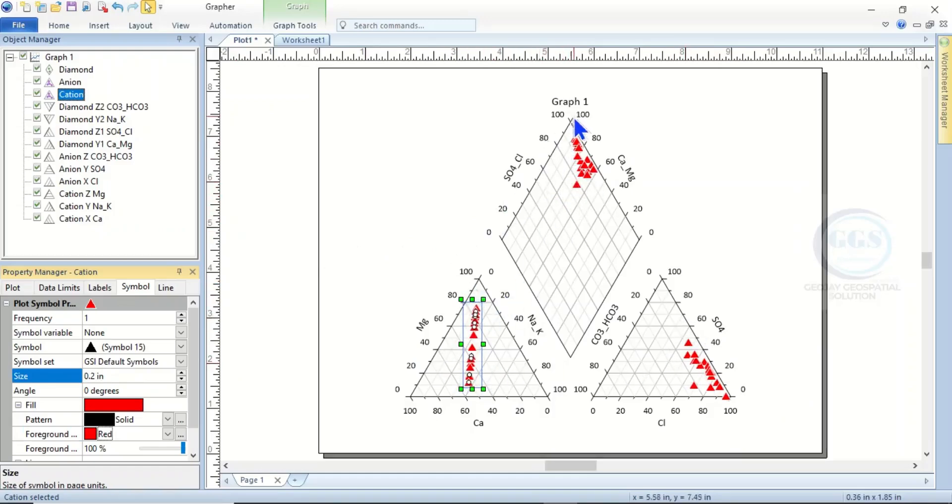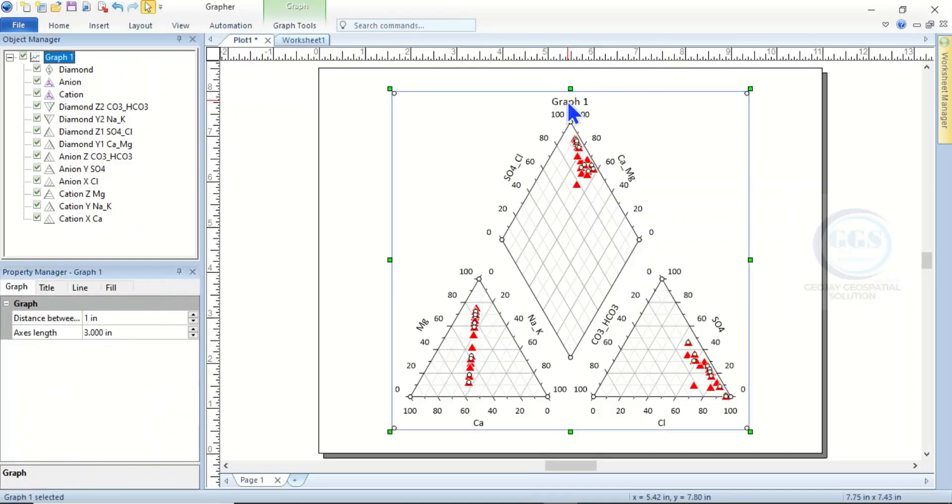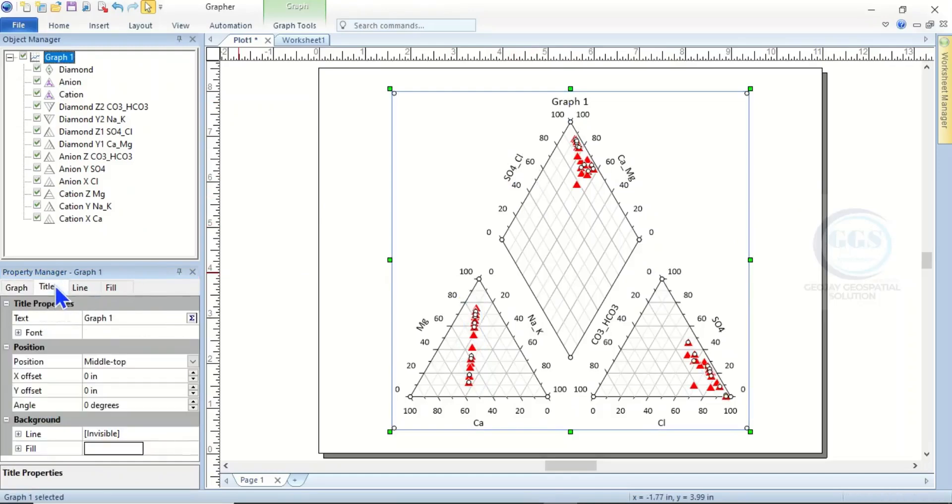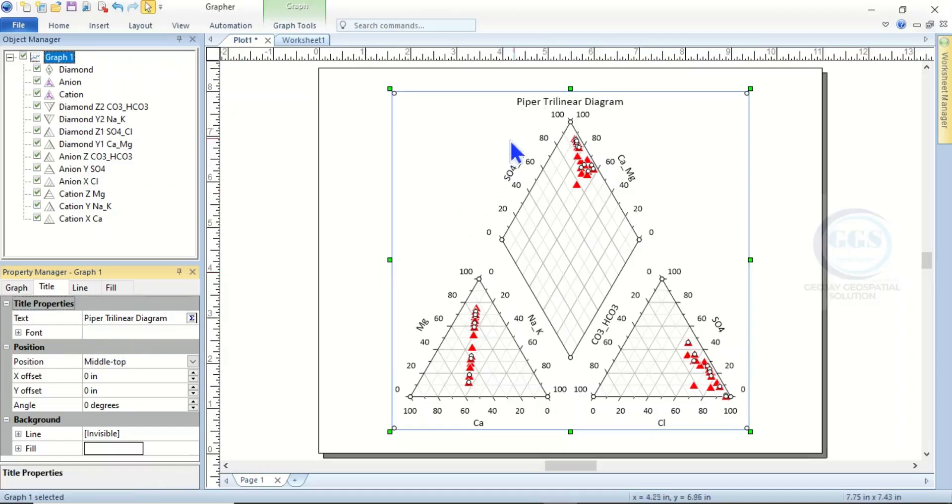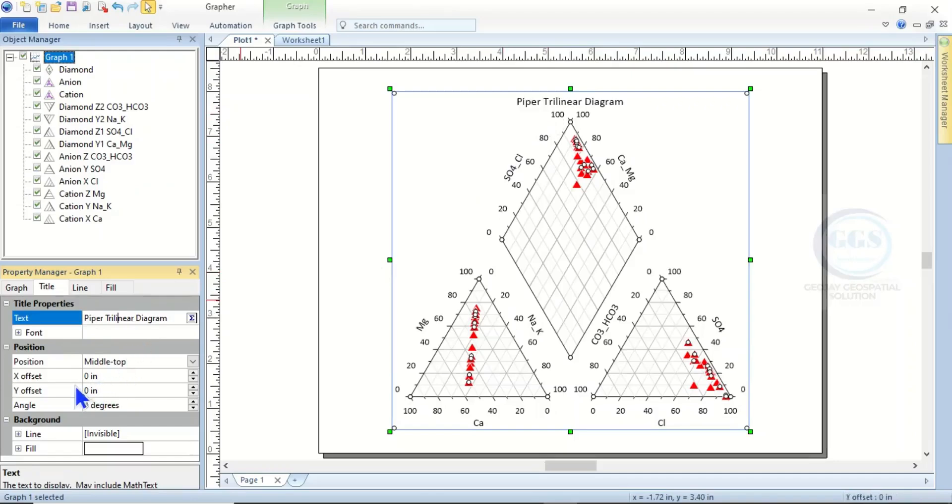Now you can also edit the title. To do that, highlight the graph and come to Title. Here, change the name to Piper Trilinear Diagram. It will automatically change, and you can increase the size here as well.